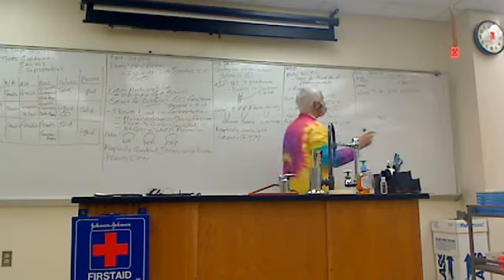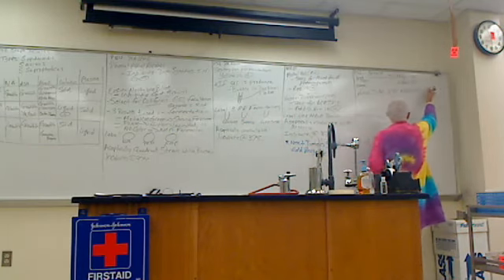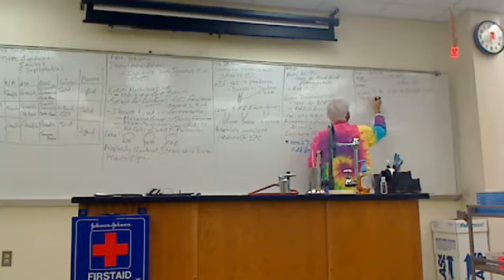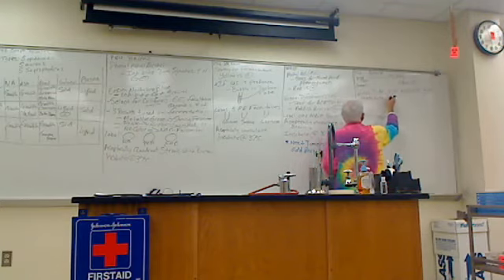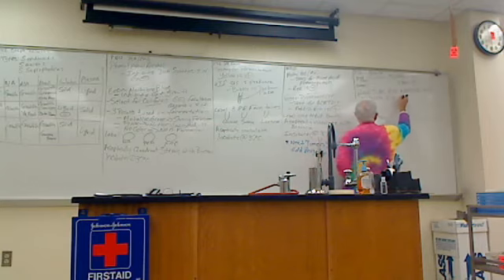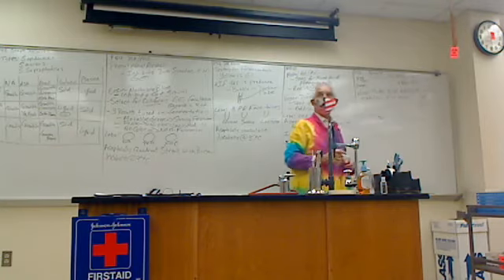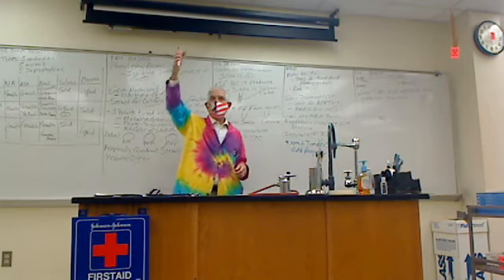So when you do that, you use the needle and inoculate urea agar. Let's say here's your tube. Stab it about halfway down, okay? So stab it about halfway down.